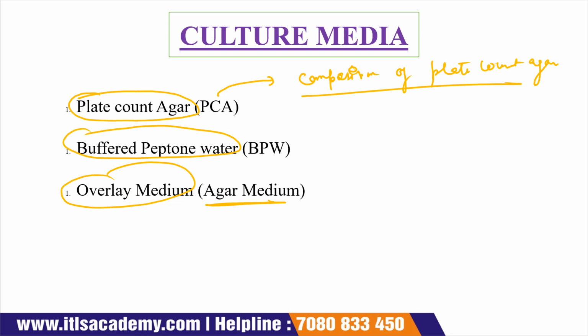Basically, plate count agar contains yeast extract, glucose, agar, and distilled water.